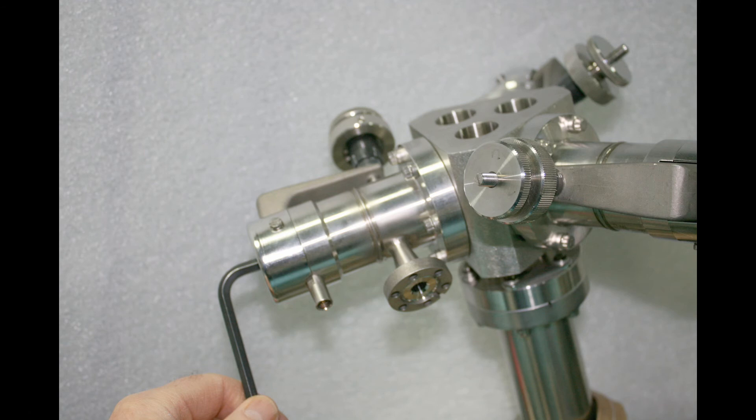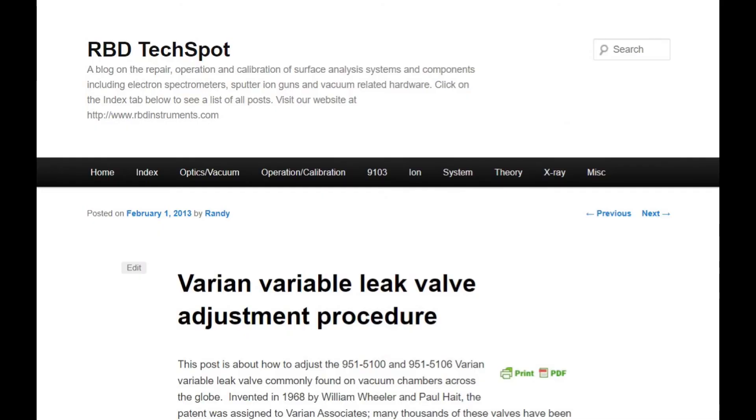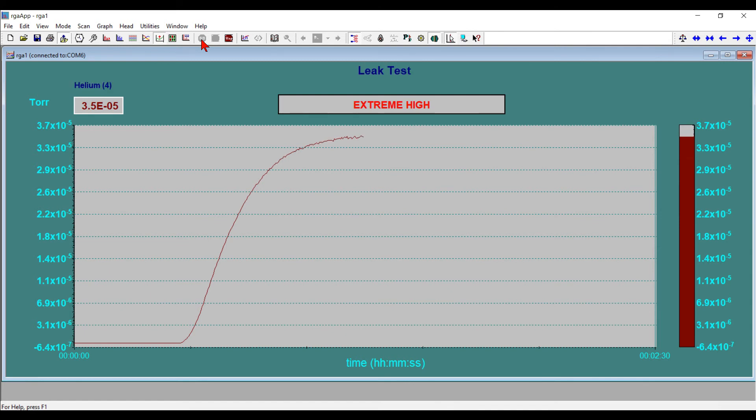To do that, we'll turn it slightly clockwise. We have a blog post on our TechSpot blog that shows how to do this procedure with a Varian leak valve, and it's the same procedure for a Baizer's. I'm going to loosen it just a tad counterclockwise just to see what the effect is — and that does prove there's a leak there. Now I'm going to turn it clockwise just a little bit, about two or three degrees. You can feel the torque as well — it's just several inch pounds, which is in the manual for the Baizer's. Basically you just want to tighten it by a couple degrees.